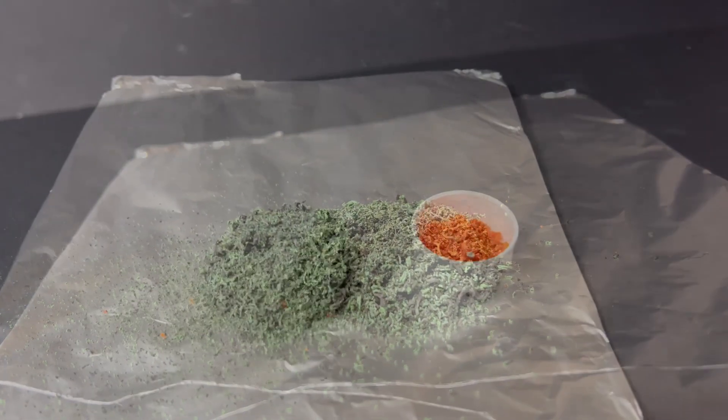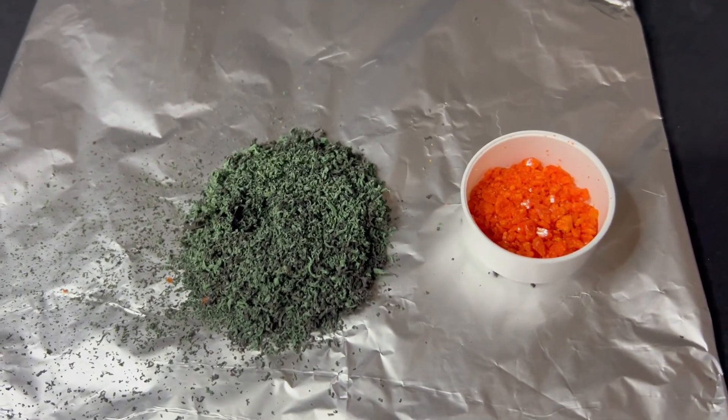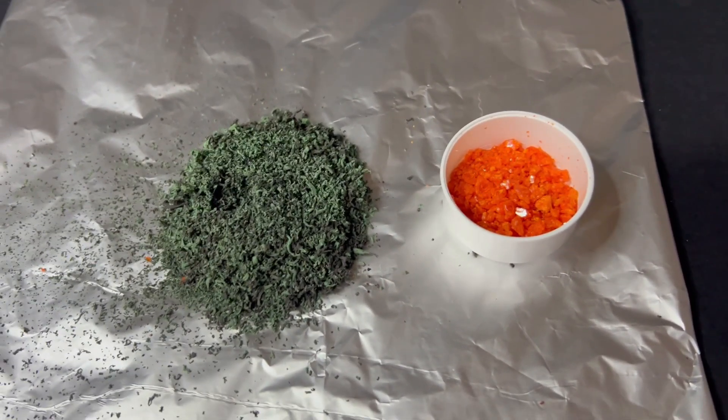Now that the reaction is complete, we can compare the original orange ammonium dichromate with the greenish black residue formed. You can clearly see the difference in colour and texture. The new substance is lighter, fluffy and dark green in colour, showing that a chemical change has taken place.